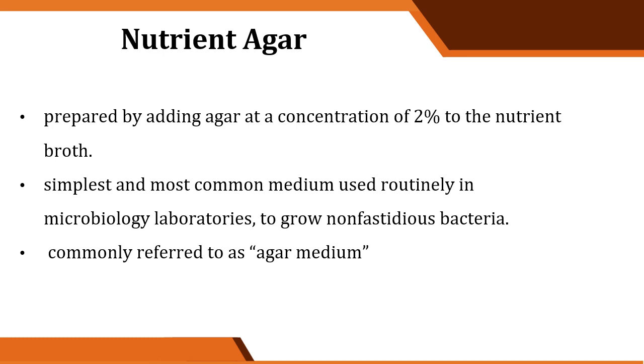Non-fastidious means it is not picky. When we say fastidious bacteria, those are the ones that are difficult to isolate. They need a certain ingredient or nutrient in the agar for them to survive. When we say non-fastidious, there is no specific nutrient needed or demanded. They can survive on almost all of the agars.